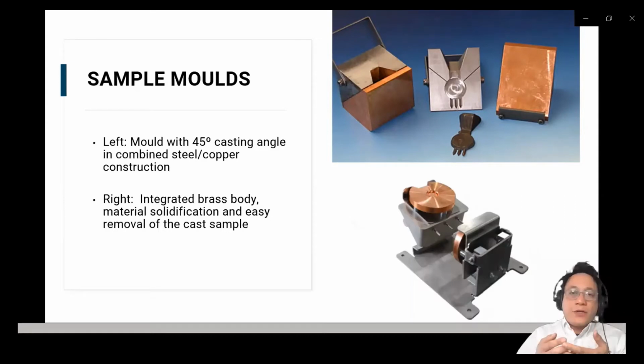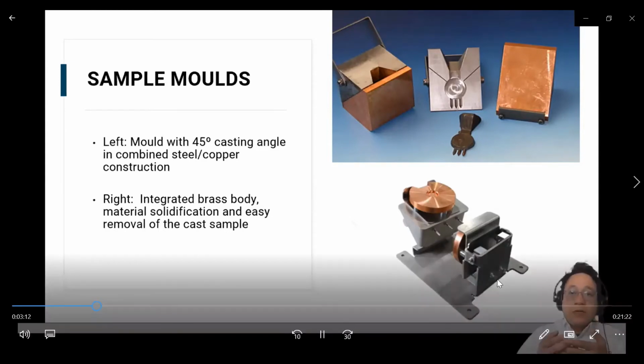After a sample has been taken, the mold needs to be cooled down to a certain temperature, otherwise the next sample will be chilled too slowly. Depending on the frequency of sampling, two or more of these sample molds may be required.